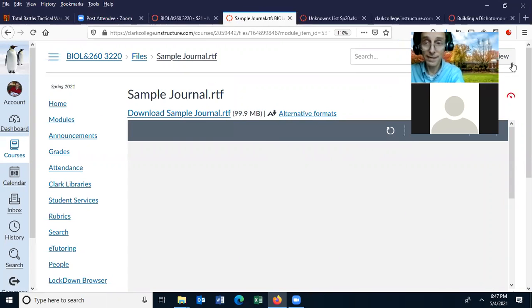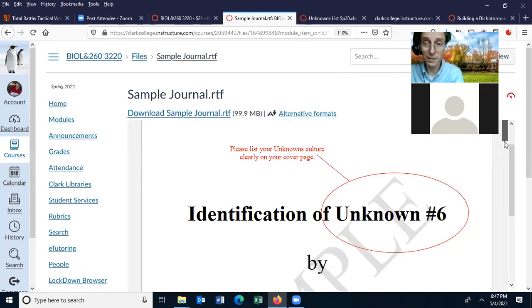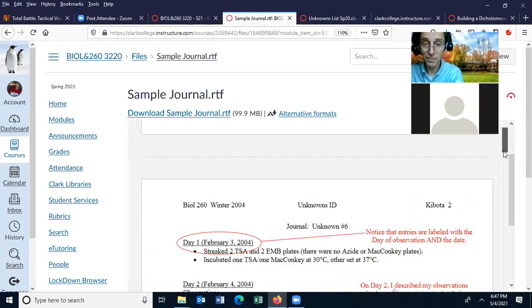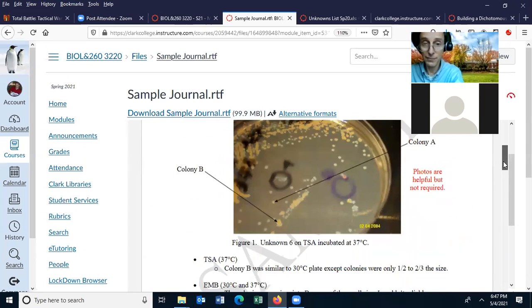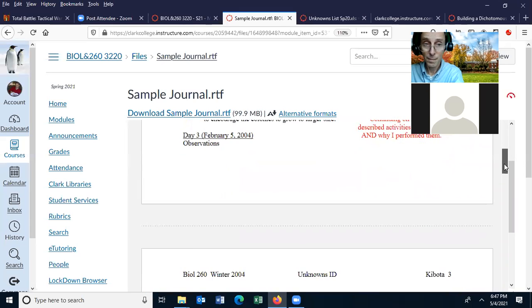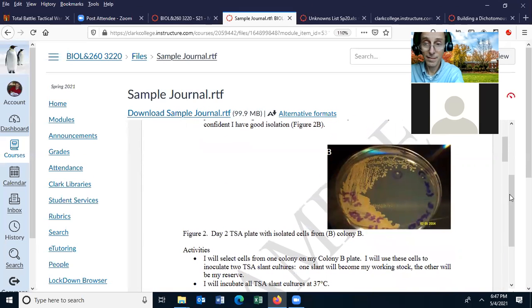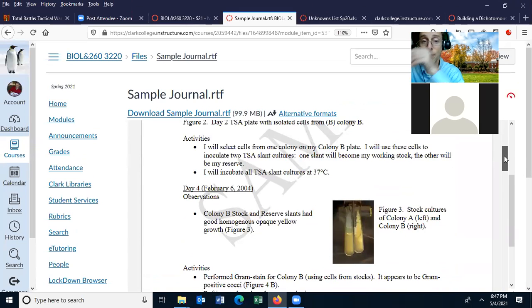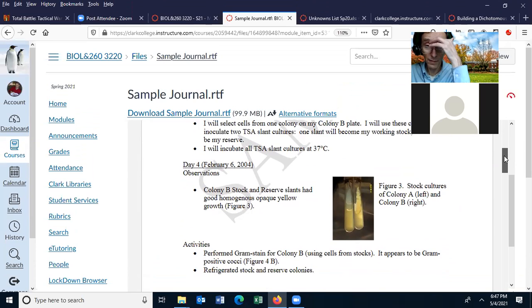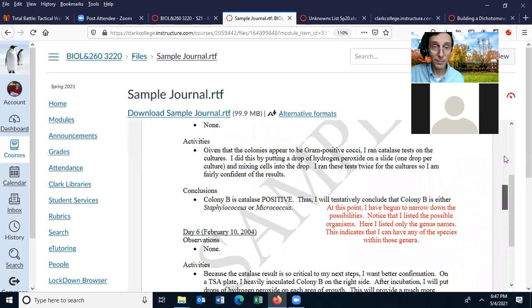And you will want to be similar, although you won't start out as he does, because he's starting with a mixed culture and having to streak it out for colony isolation and then obtain a pure culture, and then start his tests after that. You will already have a pure culture when you get it, and so you will be running tests from the start. But let me point out something that's important.